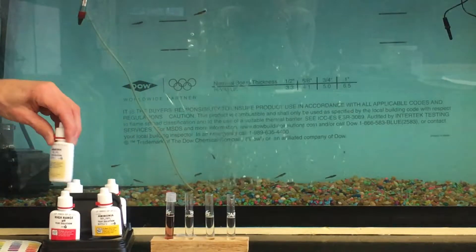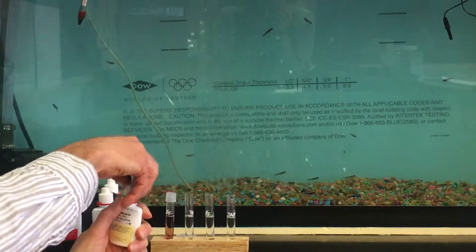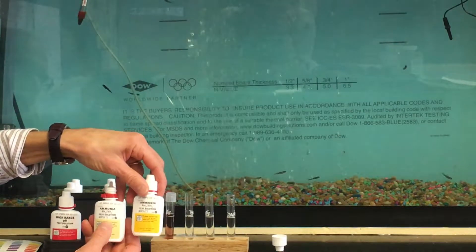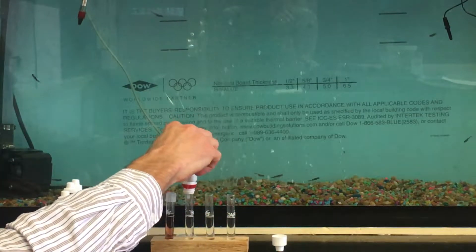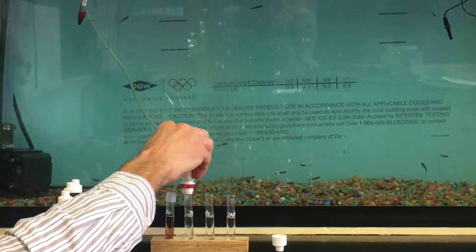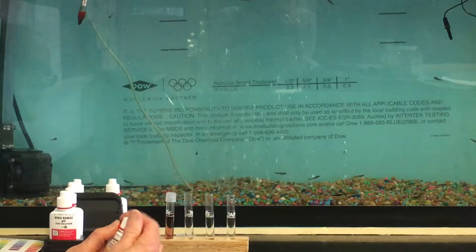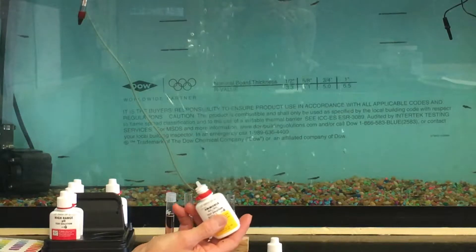That first test is ready to read, but I typically do all four tests and then read them in succession. Our second test is the ammonia test. Hold the red tab, twist off the top. This test uses eight drops and requires two different solutions — bottle number one and bottle number two. We use number one first: one, two, three, four, five, six, seven, eight. Lift it straight out and cap the bottle.